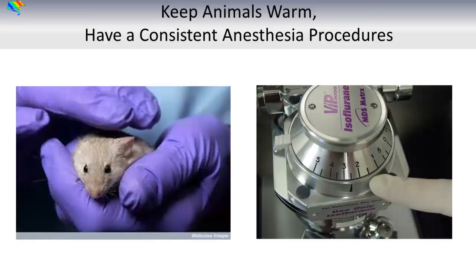Keep animals warm, have a consistent anesthesia procedure. Anesthesia and body temperature affect metabolism and may alter kinetics. Keep animals warm and be consistent with your anesthesia procedures. Always inject at the same time point.